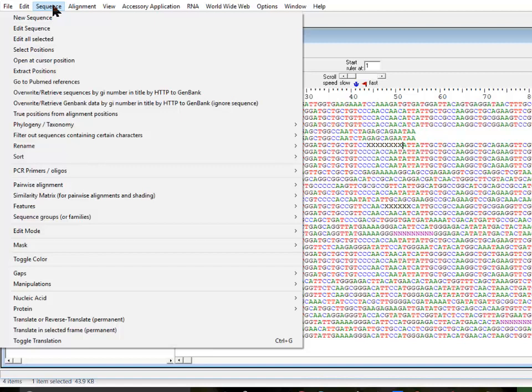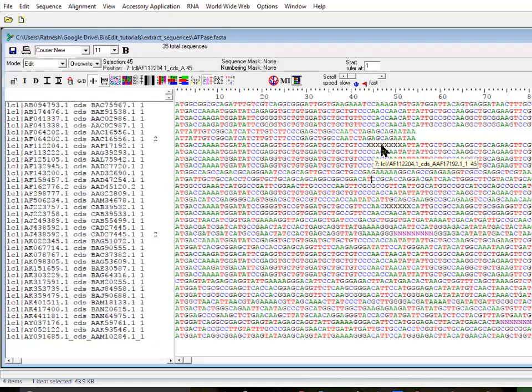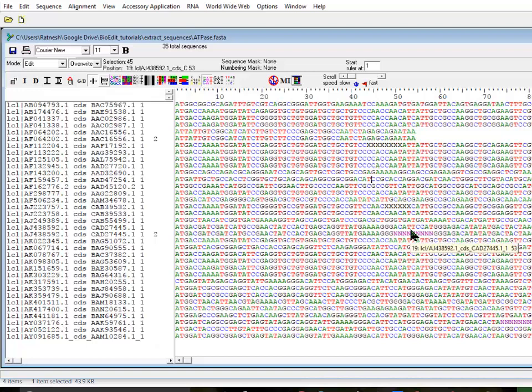Sometimes when you receive sequences from a database or whatever resources, they might have certain characters which you don't want to handle. For example, in these sequences I have introduced X's and N's in certain places.